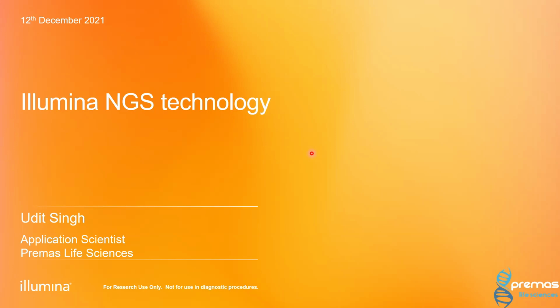Then we are going to understand how the workflow goes around your Illumina NGS. So from your sample to your final result, what is the intermediate process that is involved in this entire NGS setup? We'll discuss that. I have some video also.